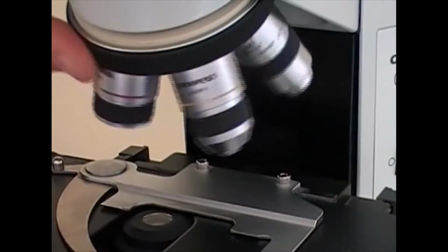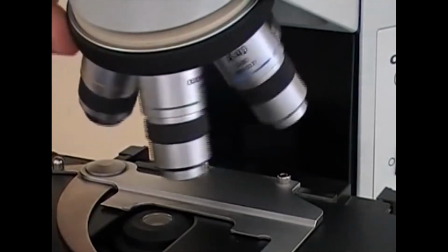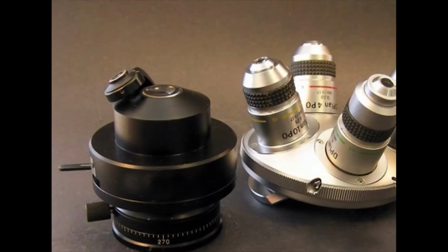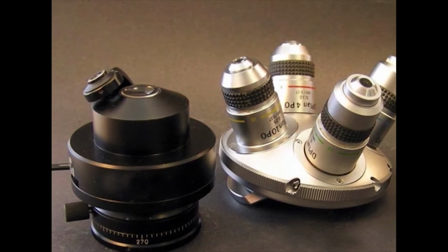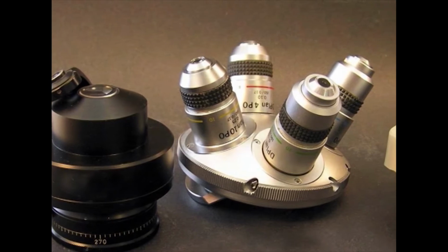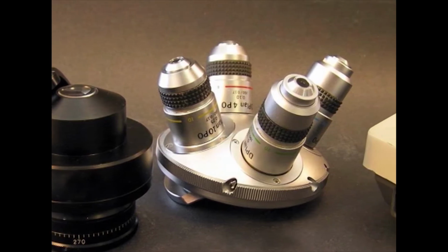Mounting of the objectives. Objectives are mounted on the microscope tube in various ways. Each petrological microscope is designed in such a way that objectives may be changed simply and quickly. In old types of microscopes, each objective is screwed into place as it is needed. Modern types of microscopes are provided with their revolving nose piece system or objective clutch system for mounting the objective.